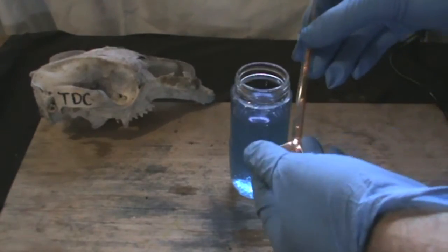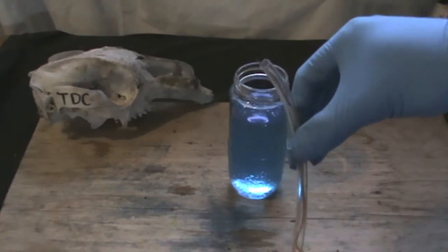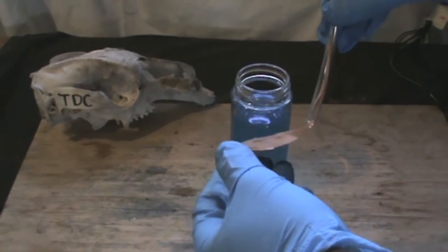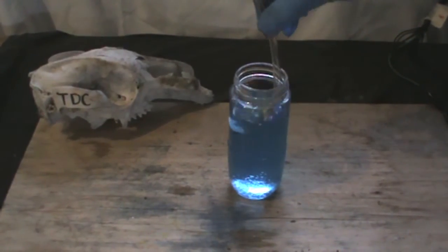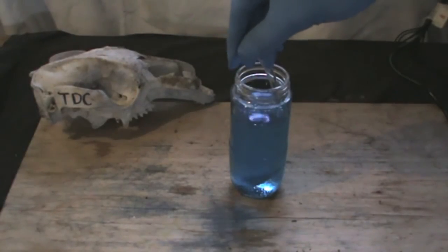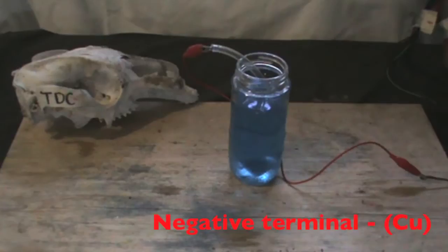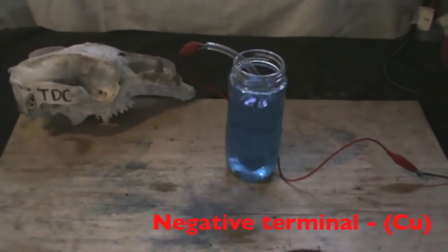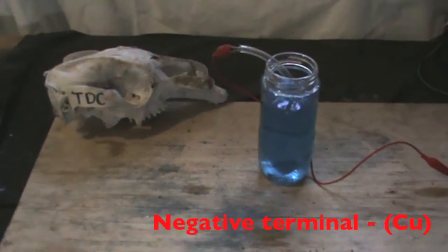After the addition of the copper sulfate, attach the copper electrode with the plastic piping around it into the cell. Attach the clip to the negative terminal of the power supply. This is your cathode.